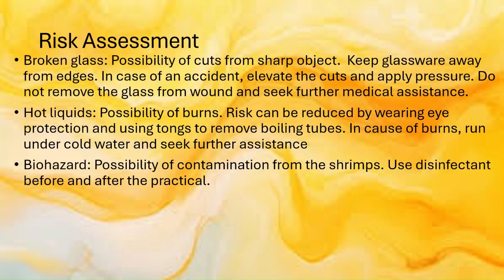So what is the risk assessment of this practical? So there's the risk of broken glass. So there's a possibility of cuts from sharp objects. Keeping glassware away from edges is really recommended. And in case of an accident, elevate the cuts and apply pressure. Do not remove the glass from the wound and seek further medical assistance if needed.